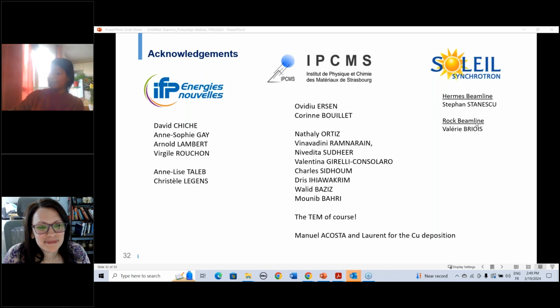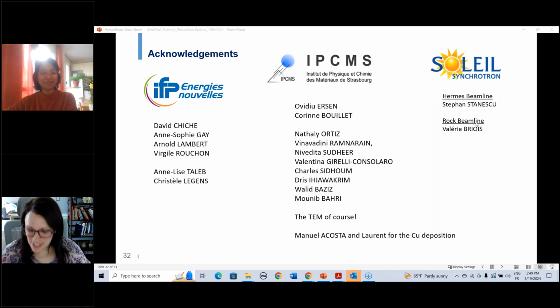one of the things. If we hadn't done a lot of ex situ characterization before, we would have taken the TEM observation for granted, saying that okay, it's this material, it evaporates, and it's related to the material itself. But since we already have a lot of experience with our material, with other techniques that give us information about the morphology, about the oxidation state, both in situ and ex situ, we were already quite aware and knew what to expect. Yeah, you can plan it better. Yeah, exactly. It's so important.